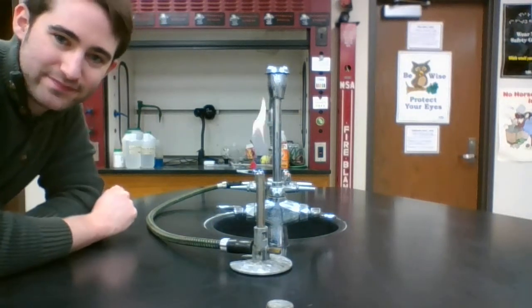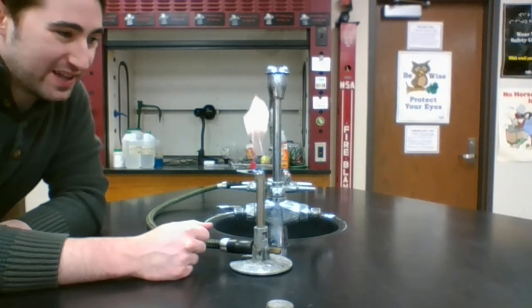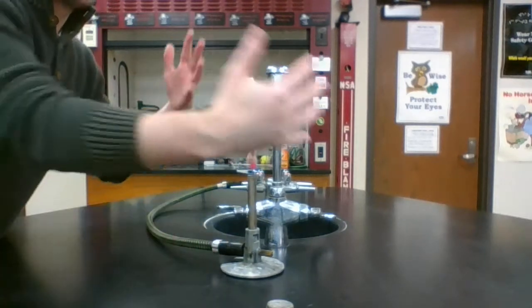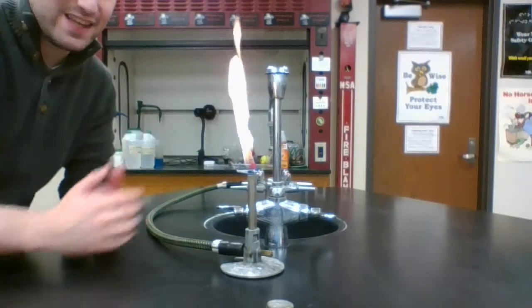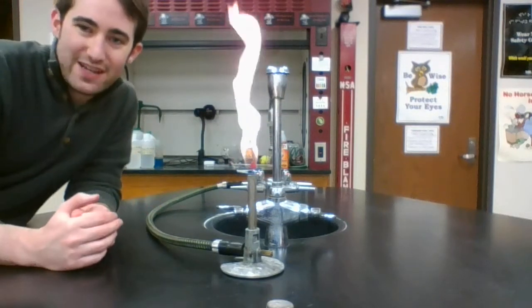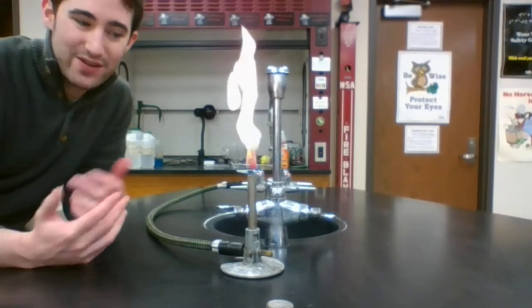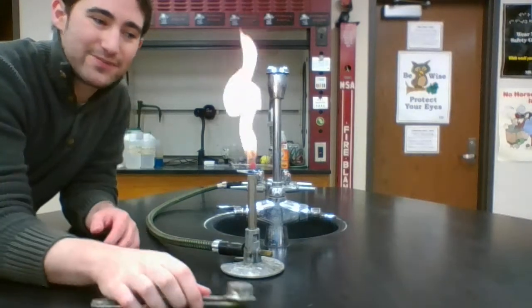There we go. Okay, so this is a flame, all right? This is a sign of a chemical reaction, okay, where we've got, it's hot. We've got some heat coming out. We've got light that we can see. That's the essence of a flame, all right? It's sort of the clues of a chemical change going on here. In this case, between the methane gas and the oxygen in the air. We just kickstart it with a spark.